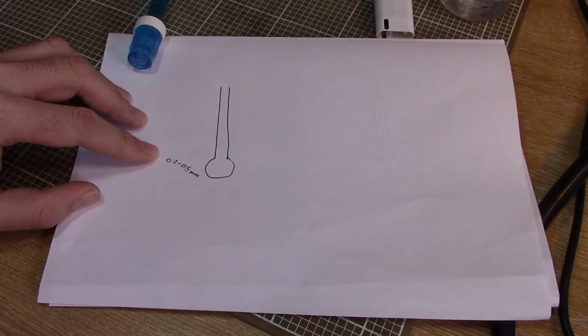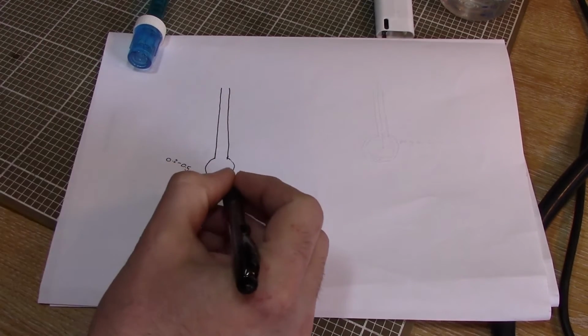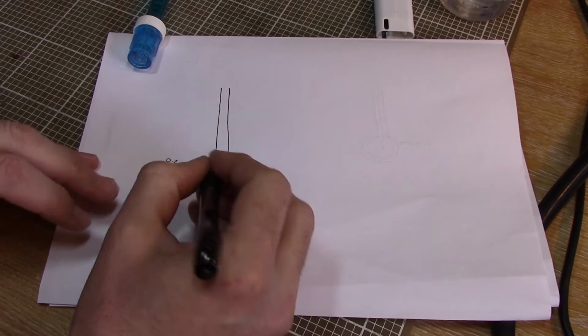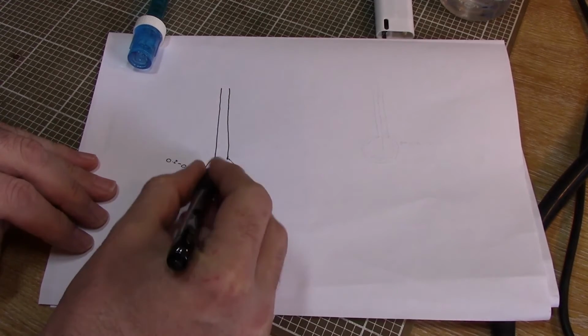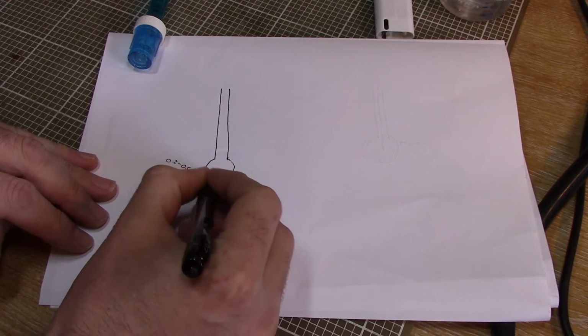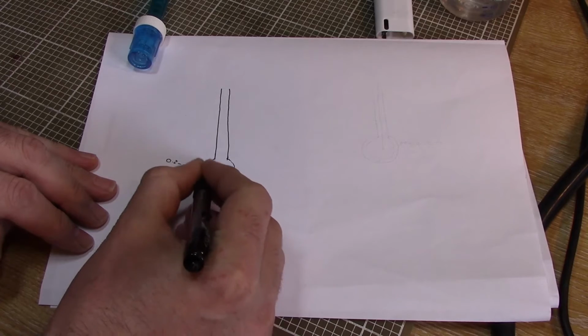So very, very thin. When I say this is magical glass, this is glass that's actually been doped with, generally I think they use lithium ions, which gives the glass itself a bit of a negative charge. And this is what's called an ion selective layer.